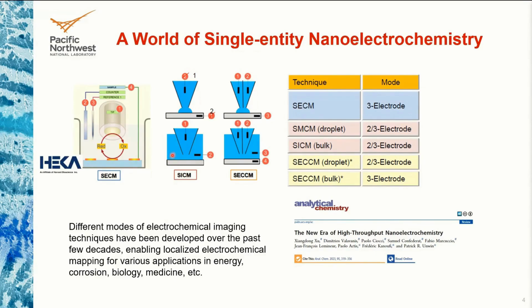And there are other versions of the SICM where the surface is exposed to an entire electrolyte solution, but still the diffusion or mass transfer is limited through the nano tip end. The improvement over the SICM was developed by Professor Unwin's group, wherein instead of a single barrel capillary, a theta capillary is used. You take a theta capillary, pull it to a fine tip, and insert two electrodes. One acts as a reference and the other as a counter, or both can act as a pseudo counter or reference, in whatever configuration you want. It still forms a tiny meniscus at the end, and then you can land it on the surface, and it makes a perfect three electrode traditional cell. The only thing is that you are selectively exposing only the tiny electrolyte area formed by the meniscus when you land on the surface.